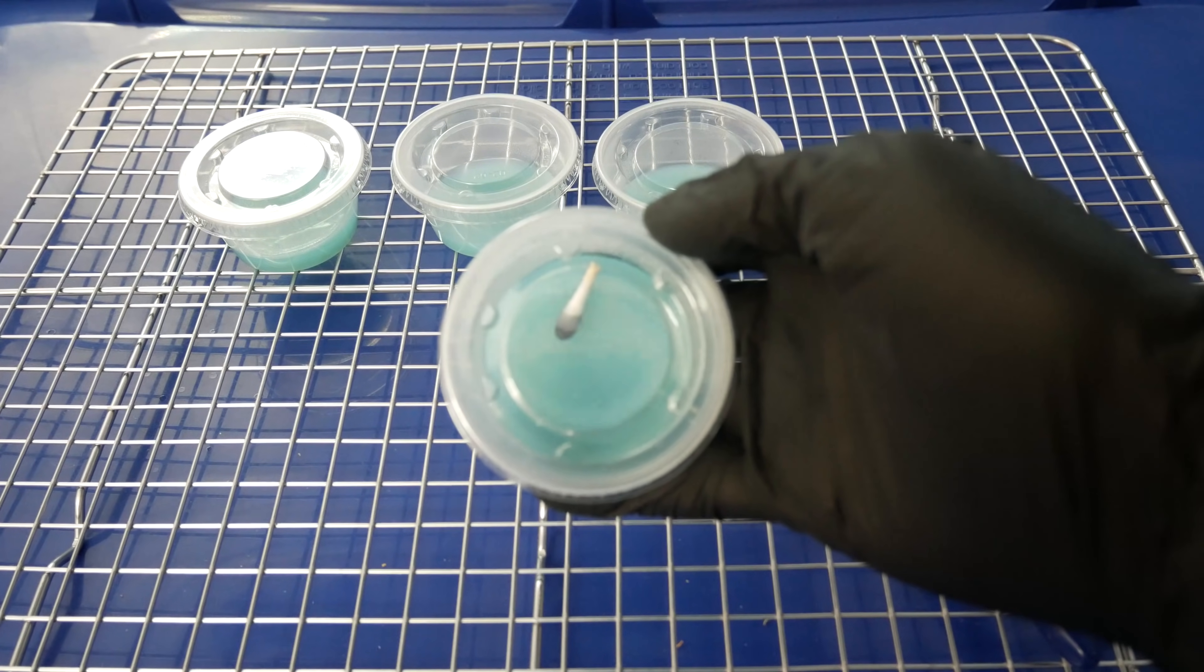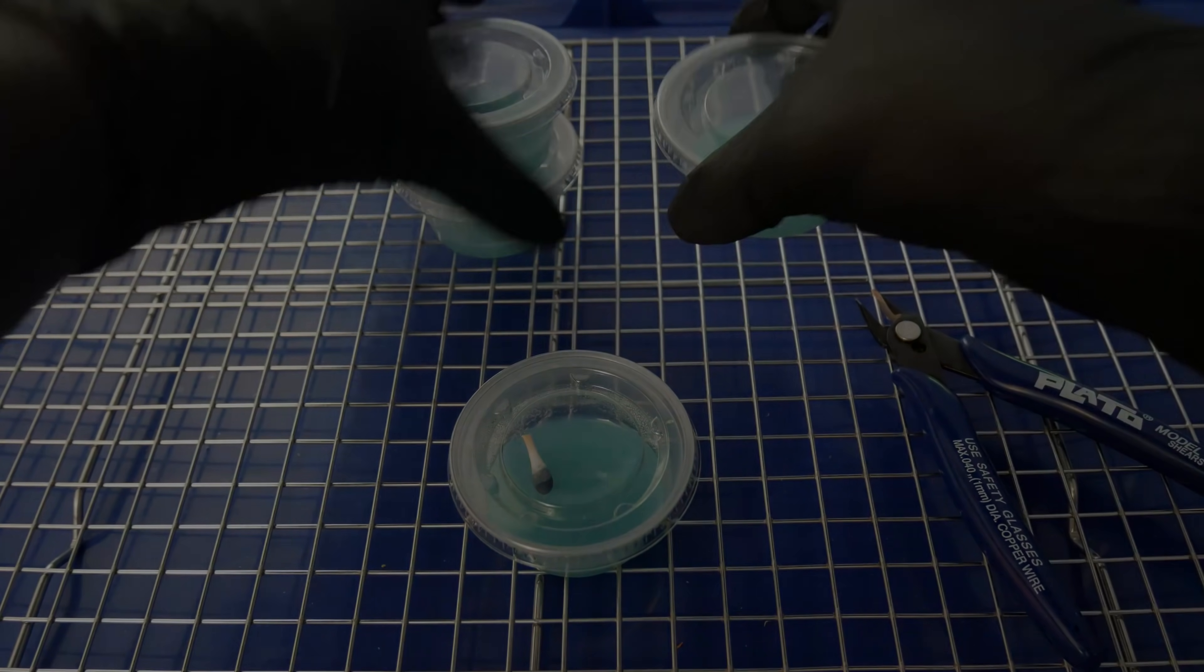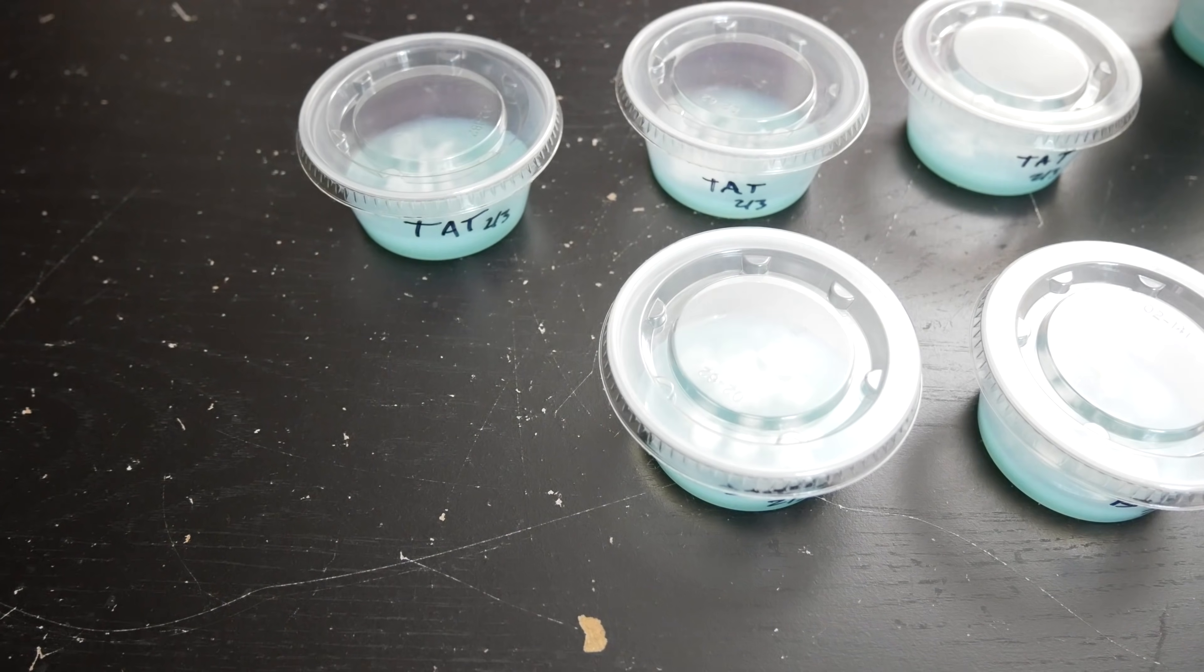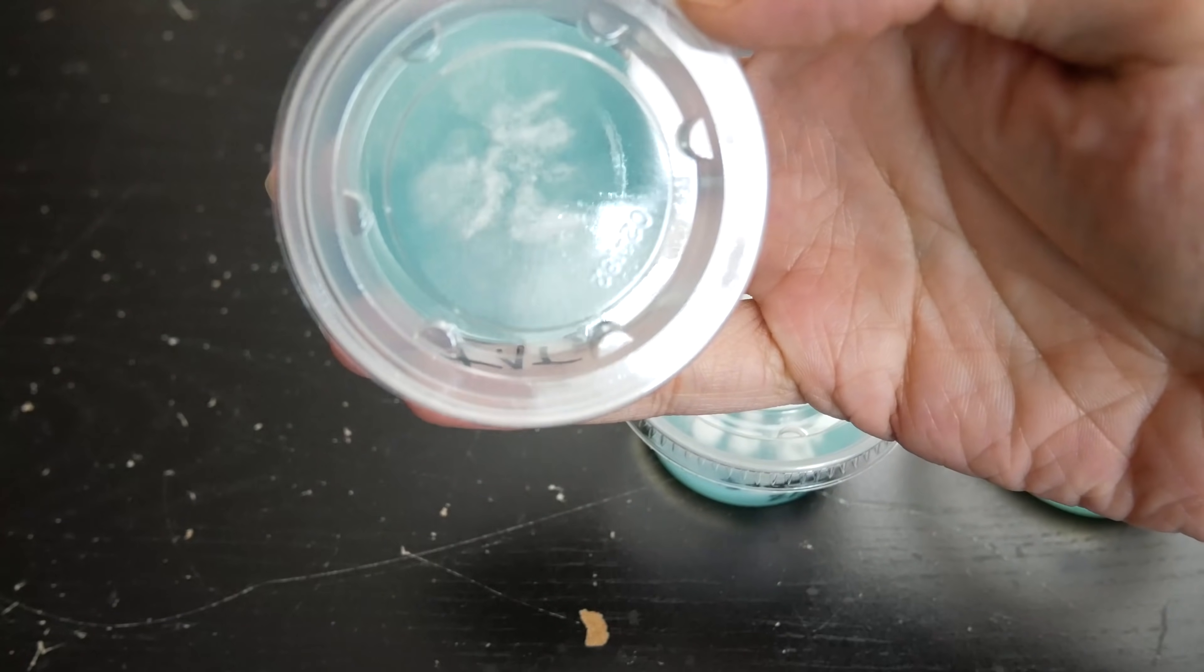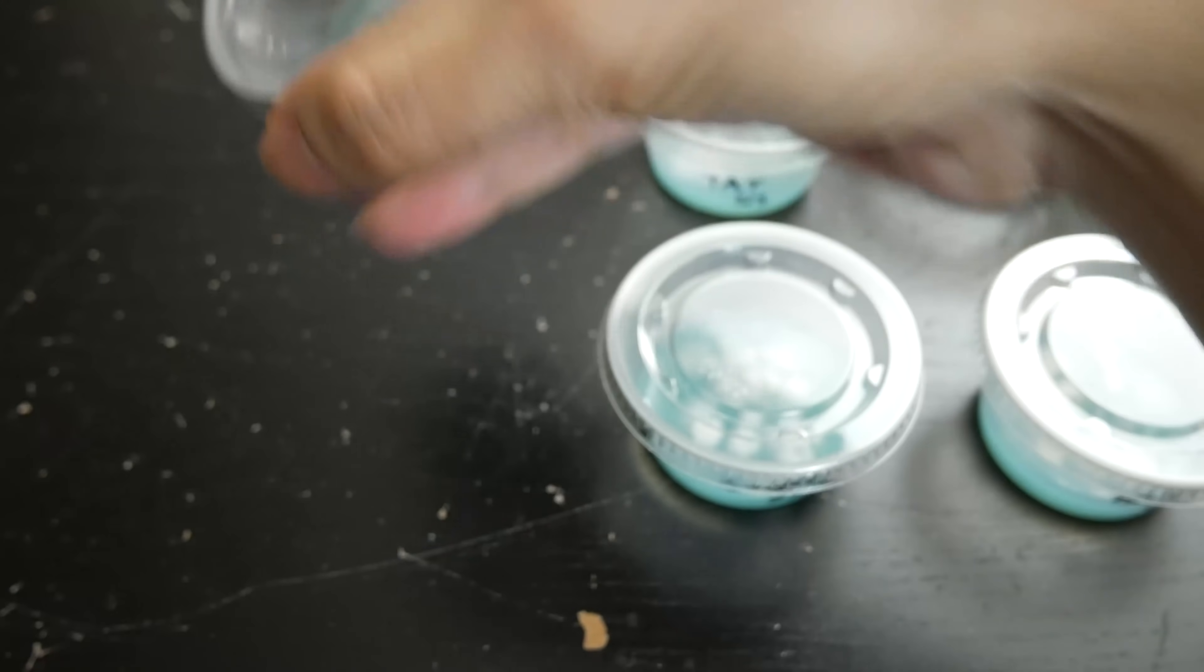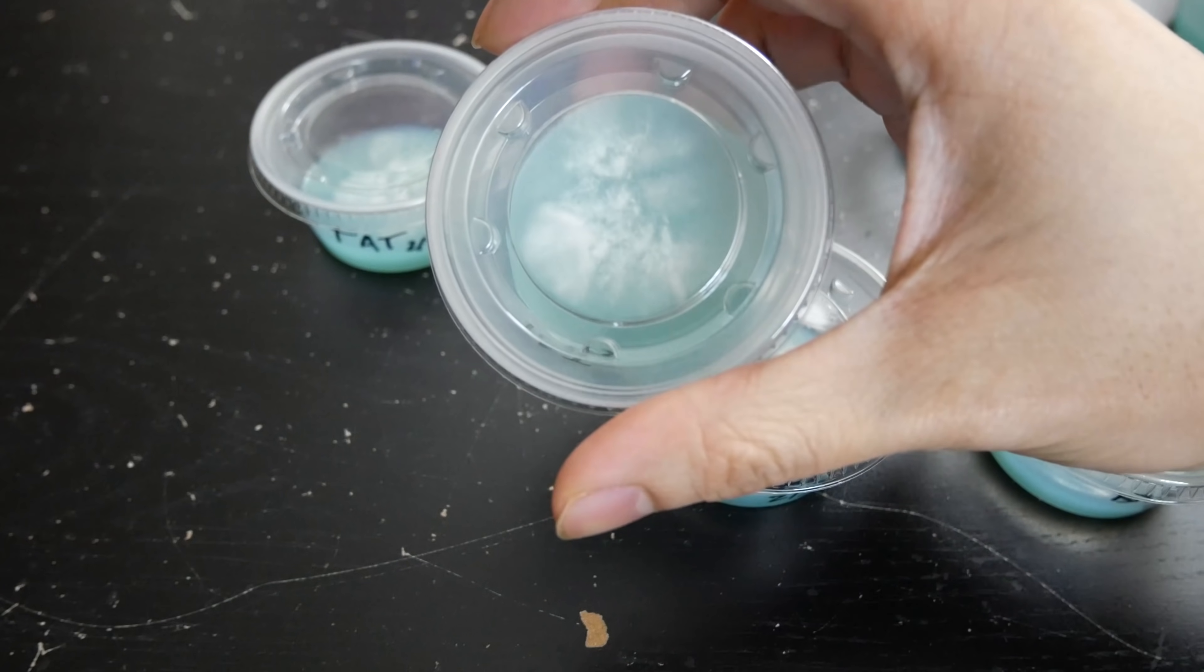One week later. All right, after about seven days here, this is what you might see from your agar dishes. You see little mycelium start to germinate in our cups. What we didn't see there before is now showing up pretty clearly.